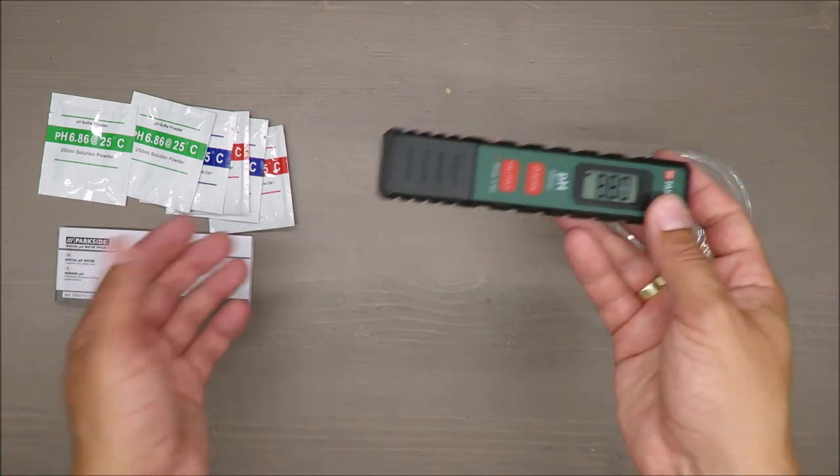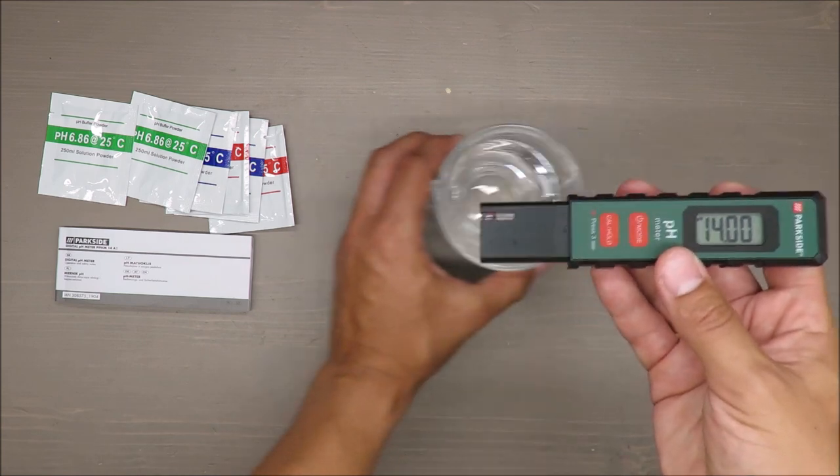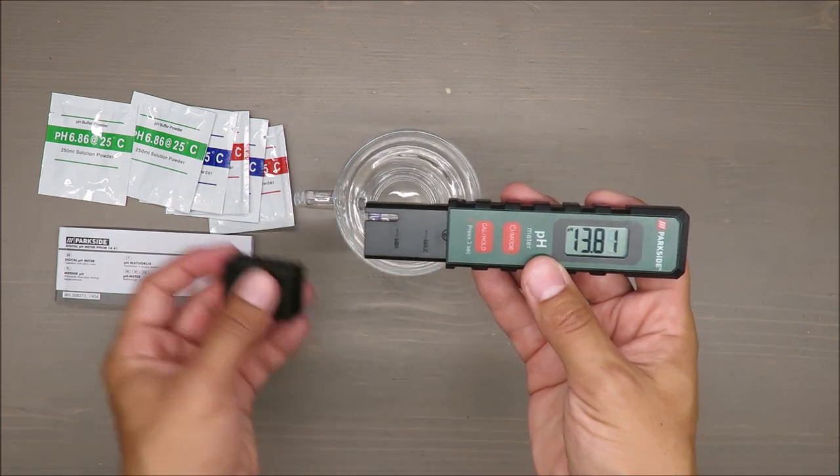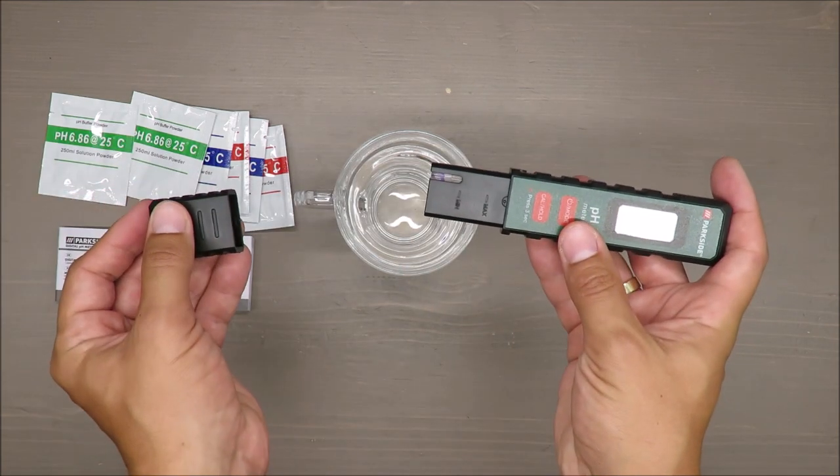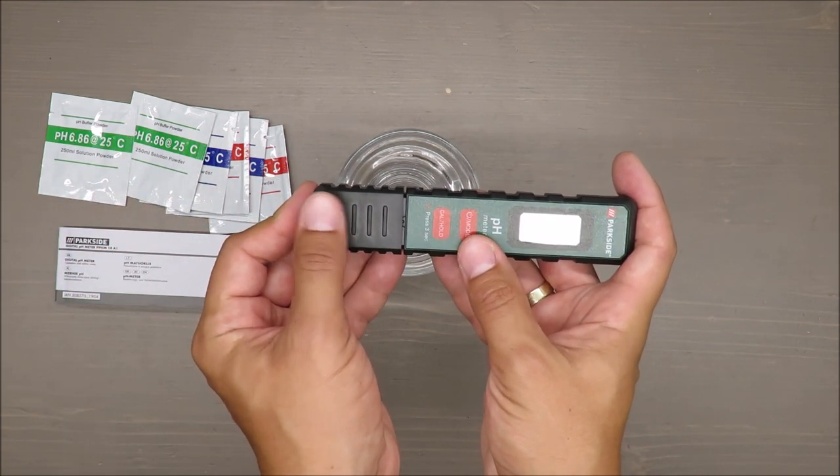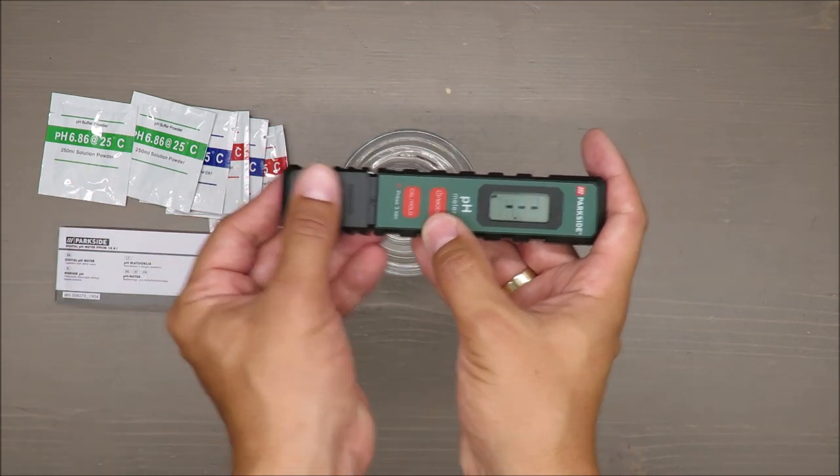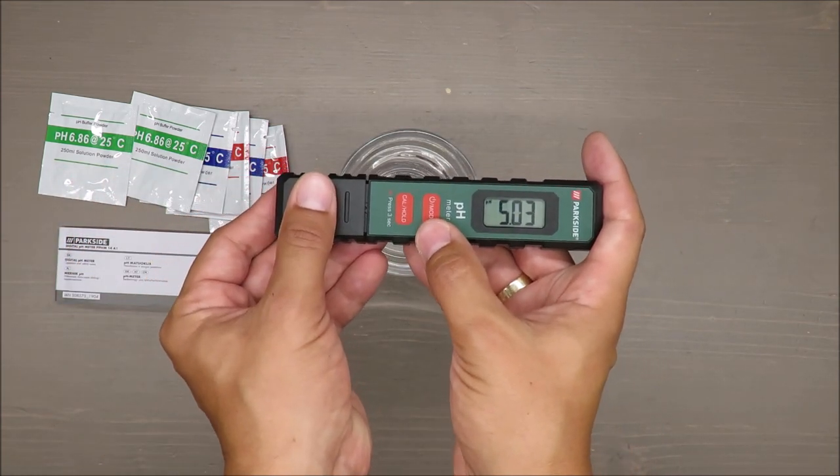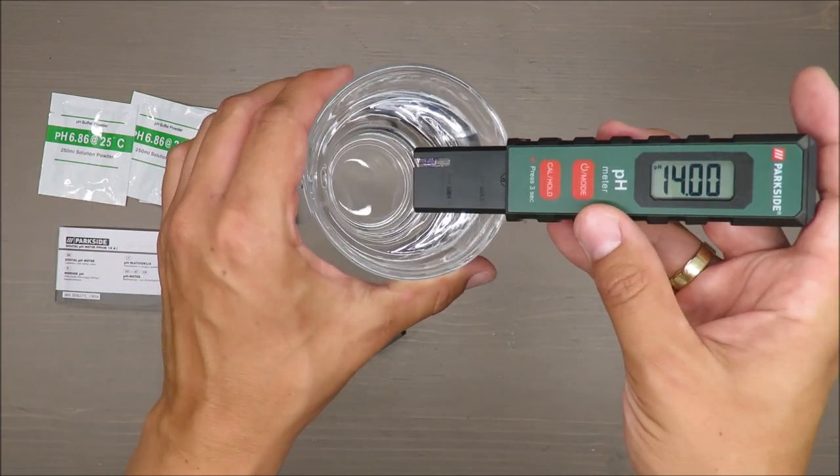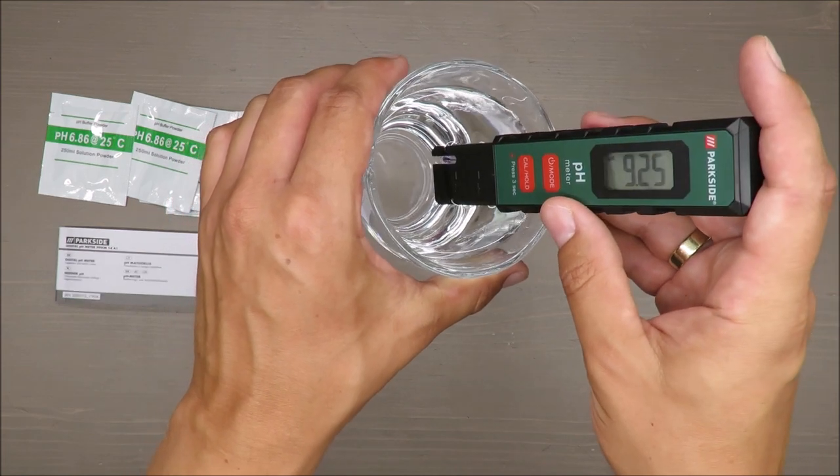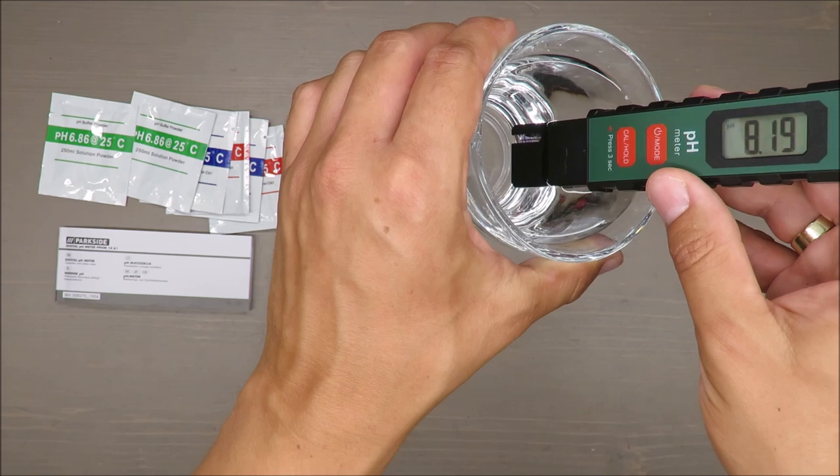I will just measure it straight away and let's see. Even the air is measured. That's interesting, actually I don't know what's happening. Without cover 14, with cover it increased. Okay, let's check. I will do my best, and as I mentioned, 8-point something.